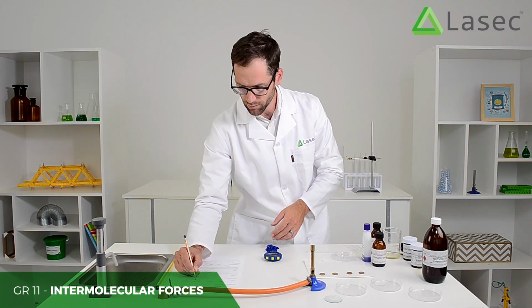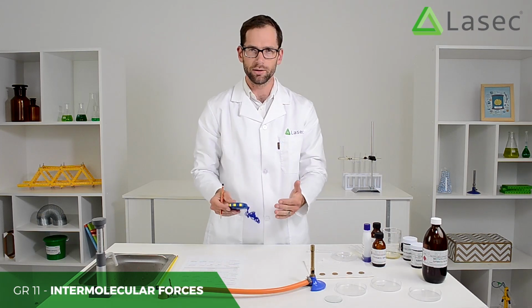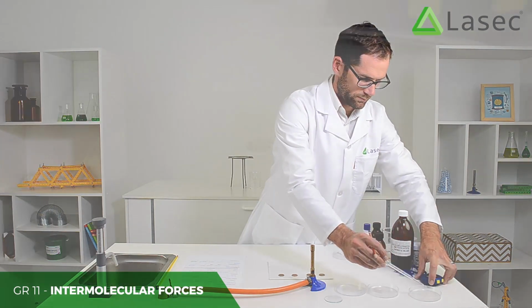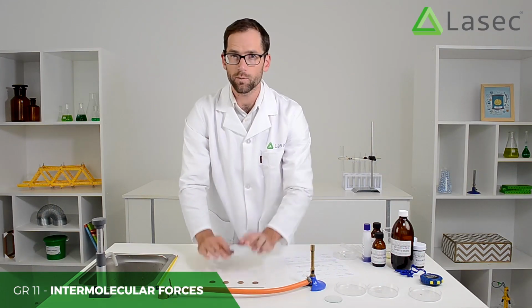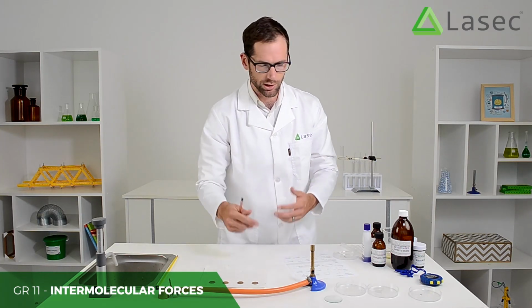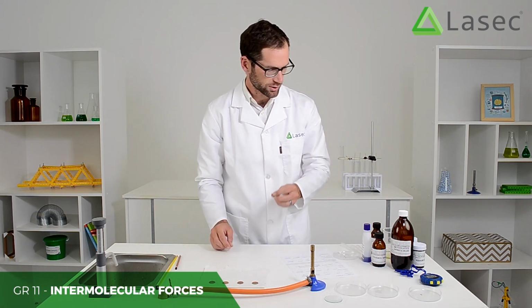And what I'm going to do with the water, I'm actually going to start it and then carry on, because water is going to take a lot longer to evaporate. Just while that's running, I'm going to carry on. I'm going to take a look at surface tension. So what I've got here is 4 20 cent pieces. You could use 10 cent pieces, 50 cent pieces, depending on how much of the liquids you want to use. And we're going to see how many drops we can fit onto each coin.